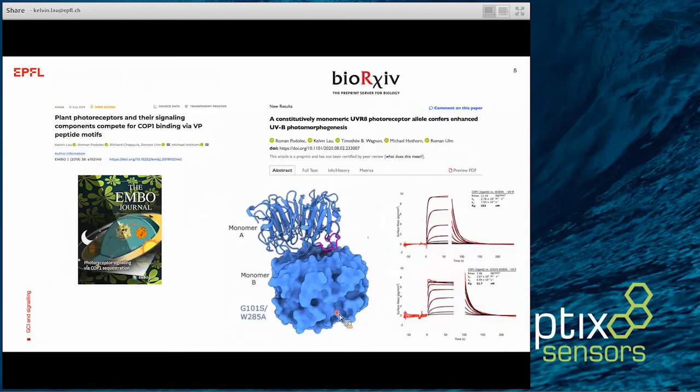And I used this machine to quantitate some interactions and kinetics. As Fabio mentioned, we were looking at mainly affinity measurements, but because the Creoptix WAVE also offered the ability to measure kinetics, we were also interested in that. Some of this work is in this manuscript and also in this preprint here, which you can look up for further info.